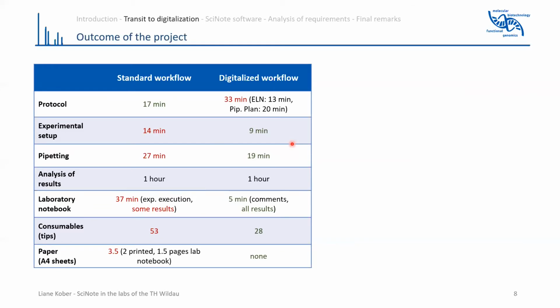The only point where it performed a bit less well than the standard workflow was the creation of the protocol. But this is attributed only to the pipetting plan, which you create on the tablet. If you have a completely new pipetting plan, this takes some time. But if you have a workflow that is established and you just want to make small adaptations to your plan, this needs just a few minutes, I would say.